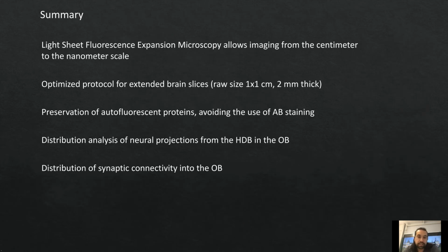Now, as a more technical summary of the technique, we can use this technique to go from the centimeter scale to the nanometer scale using one sample, so you don't lose information at all. We optimized this protocol for really extended brain slices.